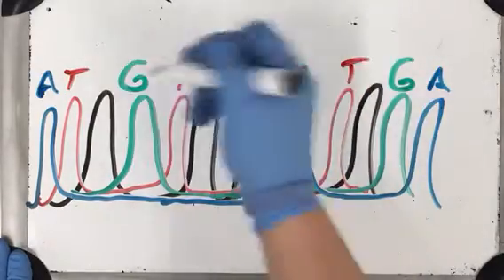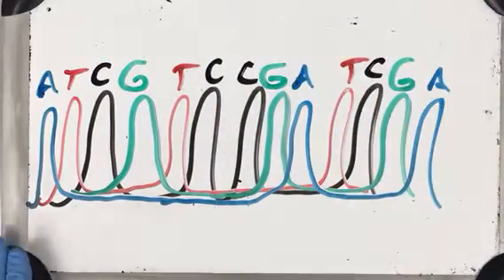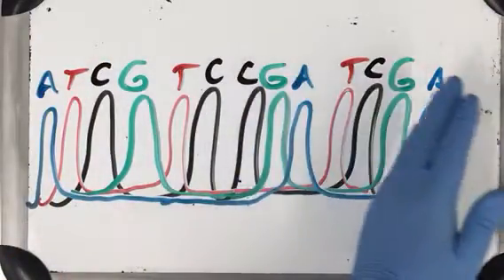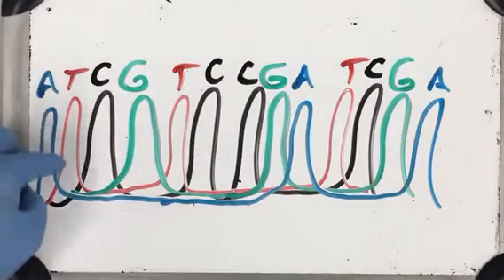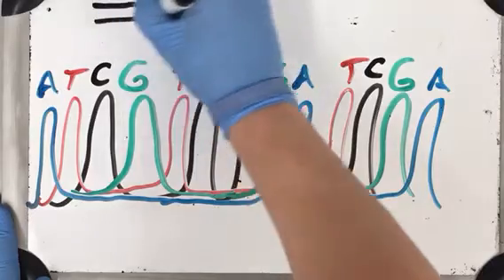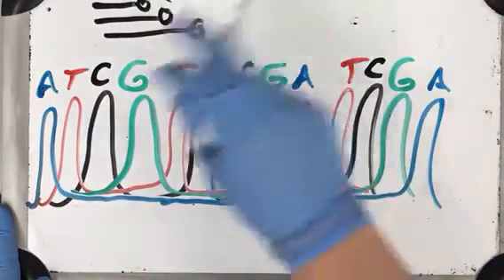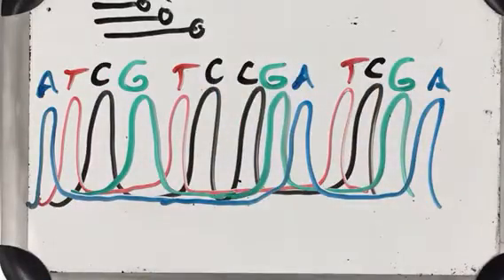Your assignment would tell you, if you were doing, I'm just gonna see, so that's how you read it. And those are the signals that we get each time, because they're corresponding to the spikes in those little signals that we get right over here to each one. So the longer they go, the further down the line they are.